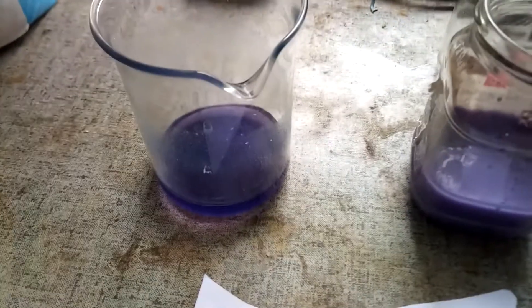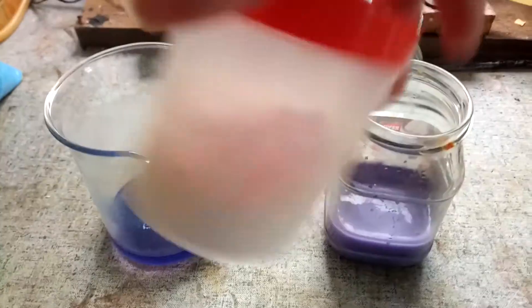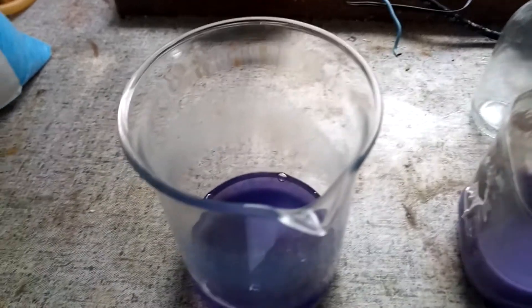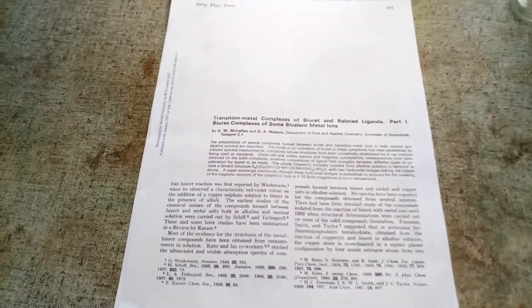I have a bunch of pretty pure biuret, so I'm going to try to isolate this complex — maybe get some nice purple crystals or something. I found this paper from 1967, and it has a bunch of really useful information about these biuret complexes.